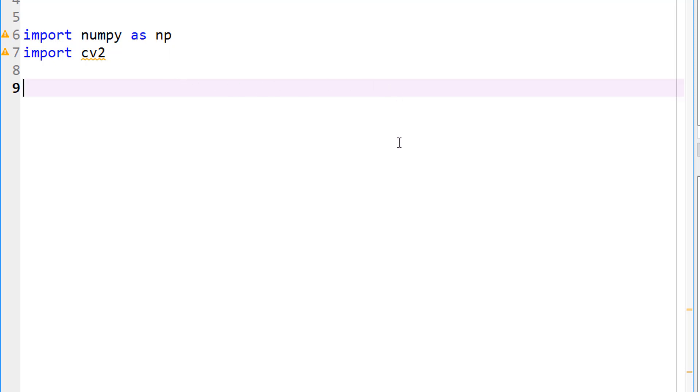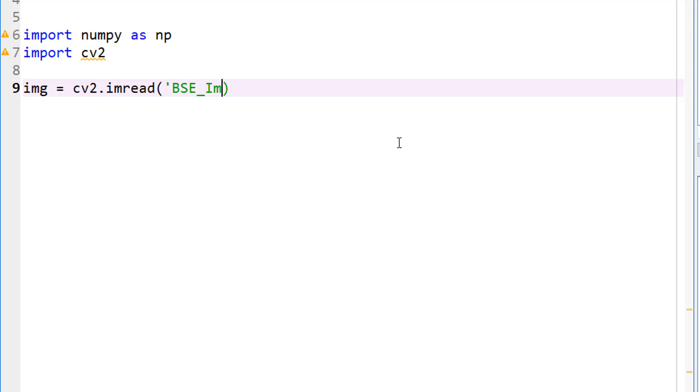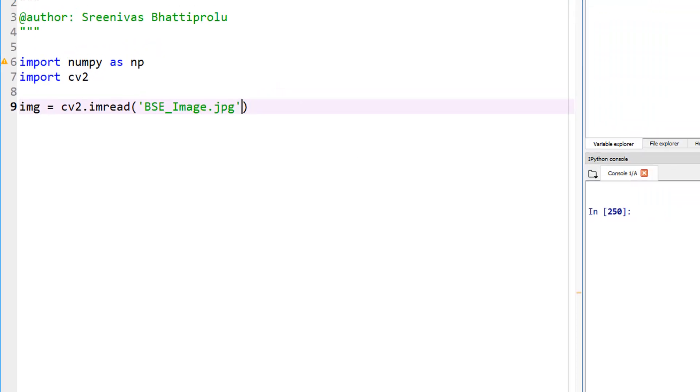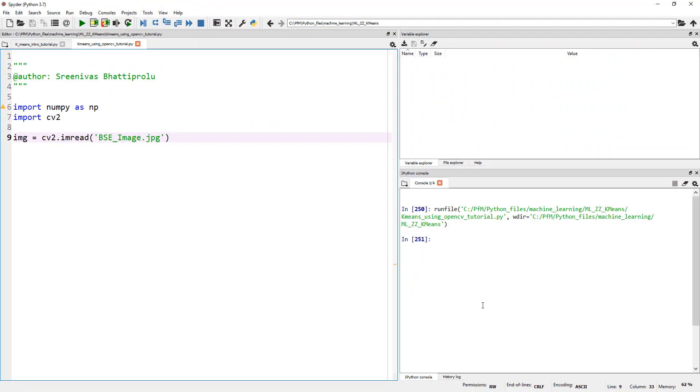I like to use the one in OpenCV because it makes it easier to handle images. First of all, let's assign a variable called img and load our image. This is imread, and my image is called BSE_image.jpg. Let's go ahead and run this to make sure everything is fine.